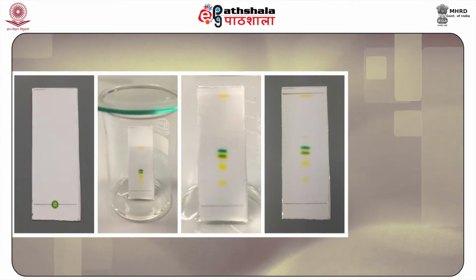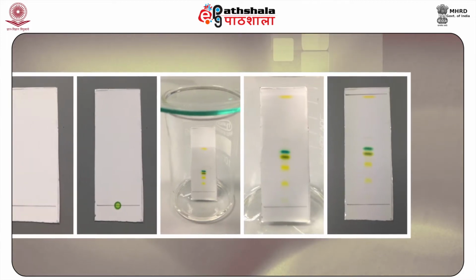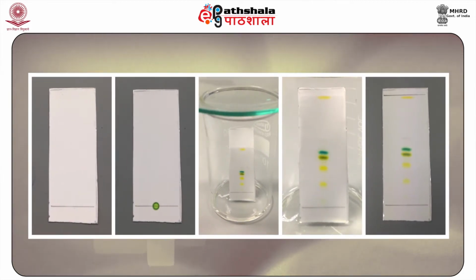The mobile phase and solute compete for the binding sites present on the stationary phase, leading to the separation of various components of a mixture. For instance, the normal silica gel is polar in nature and thus has a great affinity for the polar compounds. As a consequence of this, the compounds that are less polar in nature move higher up the plate, which results in a comparatively high RF value.